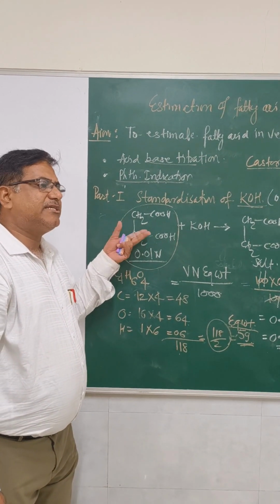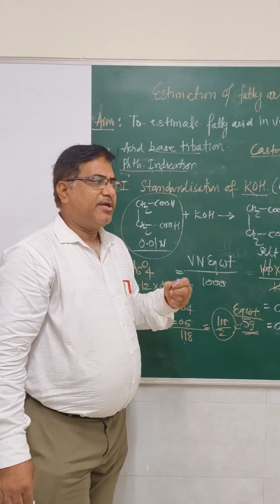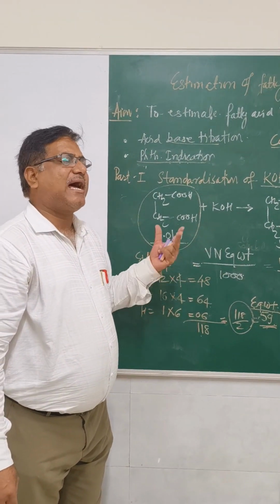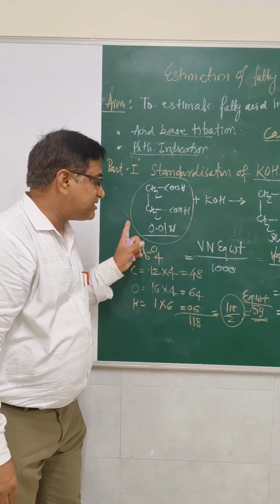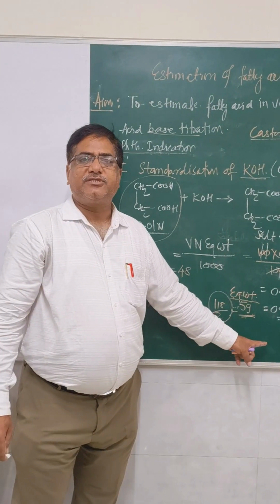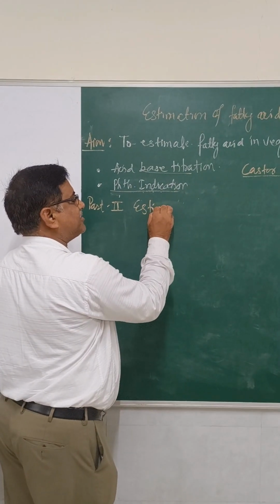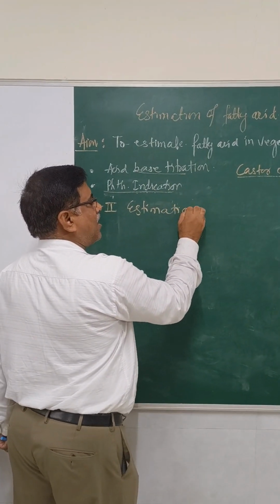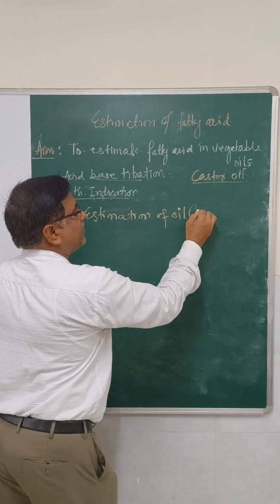Today we are using succinic acid. If I say, you can use hydrochloric acid, you can use oxalic acid, you can use acetic acid. Different acids can be used, but how the solutions are prepared, I also mentioned here. The part 2 is the estimation of oil. ये हम लोग बोलते हैं उसको fatty acids.